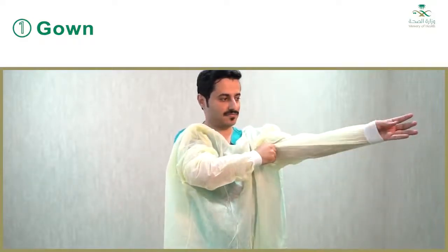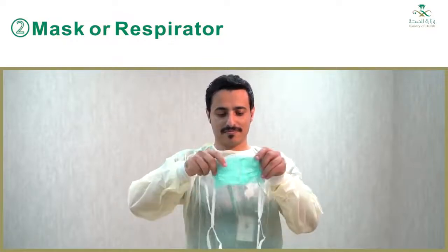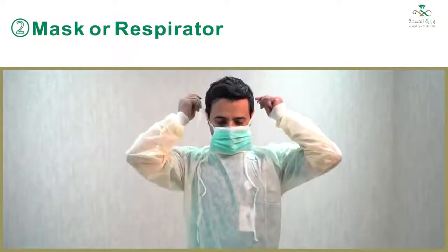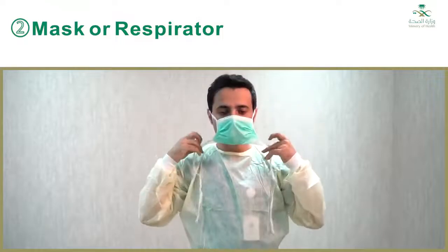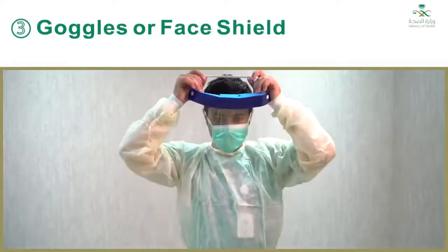Fasten in back of neck and waist. 2. Mask or respirator. Secure ties or elastic bands at middle of head and neck. Fit flexible band to nose bridge. Fit snug to face and below chin. Fit check respirator. 3. Goggles or face shield.